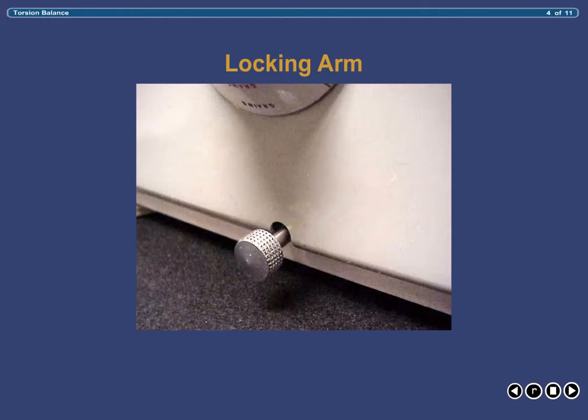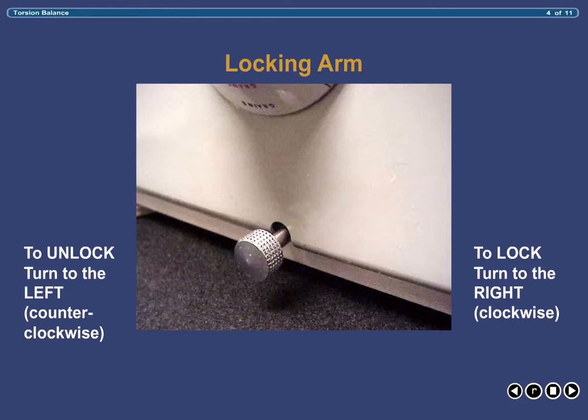The locking arm, located on the front of the balance below the dial near the bottom, locks and releases the pans during weighing. It is turned clockwise to lock the pans and counterclockwise to release them. This is an all-or-nothing event — when locking, the arm must be turned all the way to the right; when releasing for weighing, it must be turned all the way to the left. There is no happy medium. Failure to rotate the arm completely may result in weighing errors.